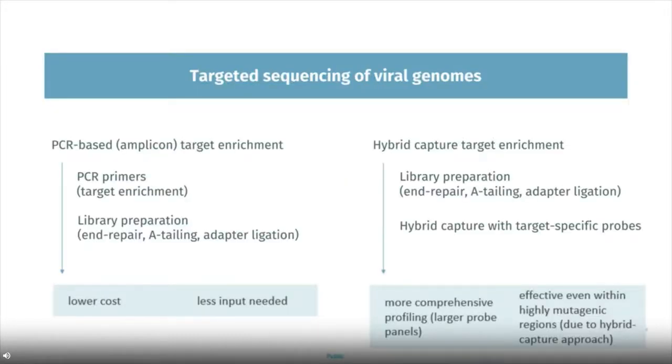So now, depending on the application, two approaches that enable identification of viral genome sequences could be implemented. In the first scenario, where the aim would be to identify new sequences of viruses that, for example, cause disease, the so-called metagenome approach could be utilized, and sequences of all species present in analyzed samples would be sequenced.